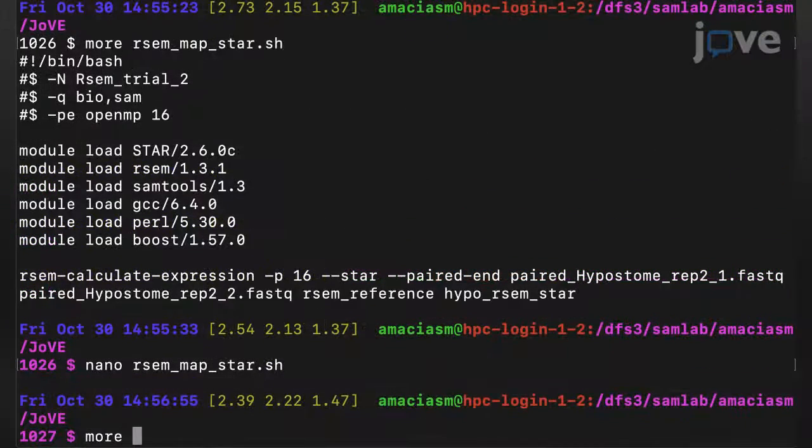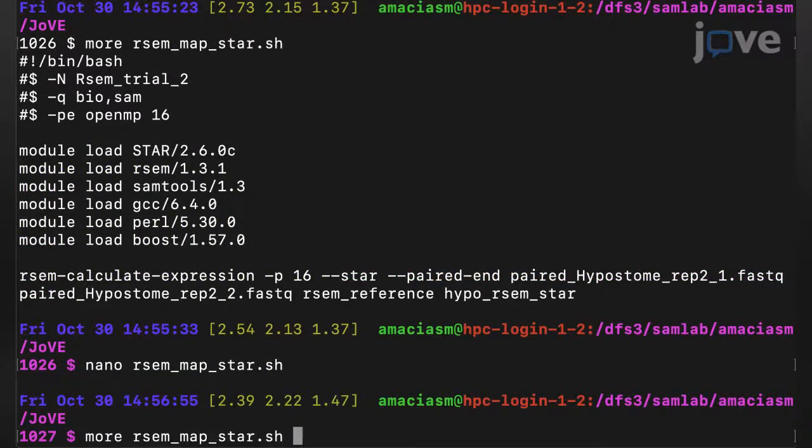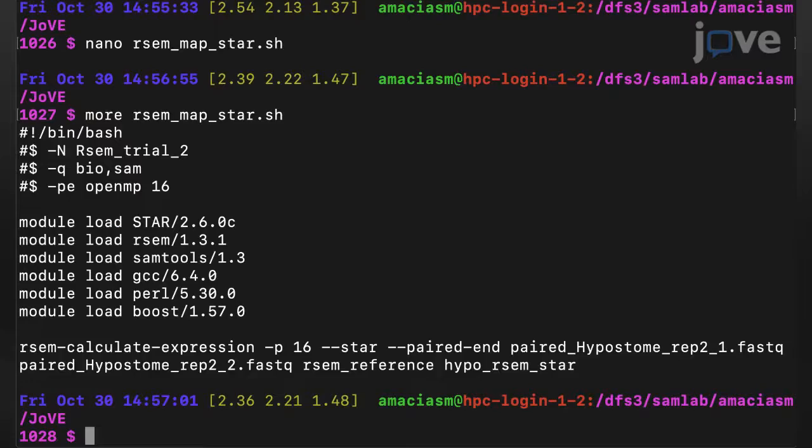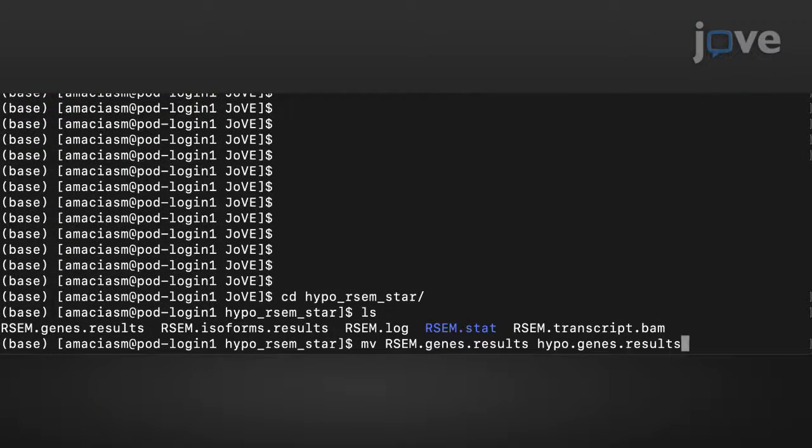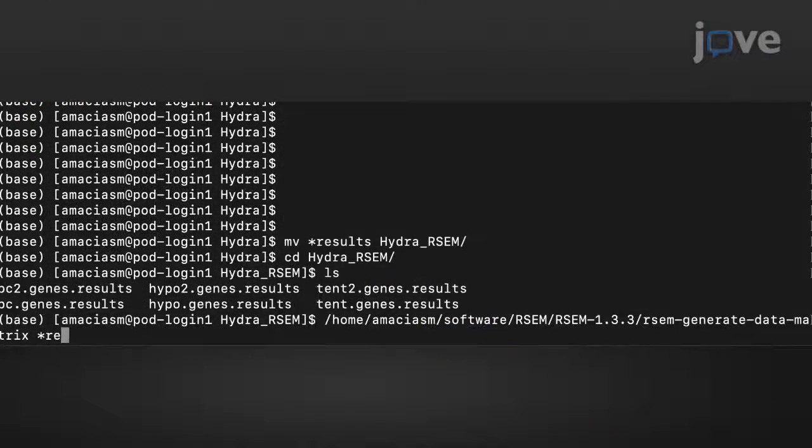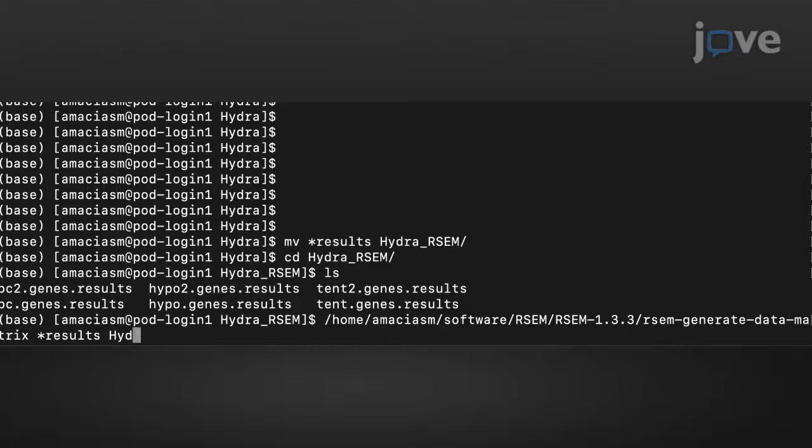Then map reads and calculate expression for each sample. Rename the results file to something descriptive and generate a matrix of all counts.